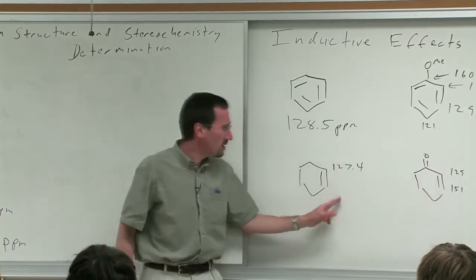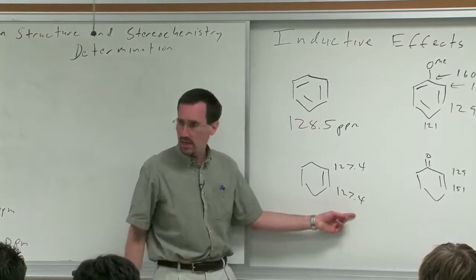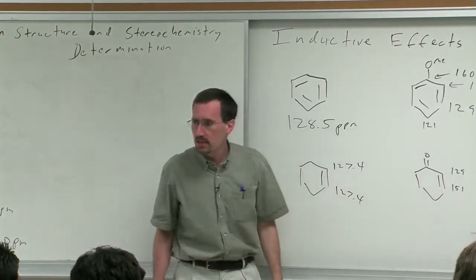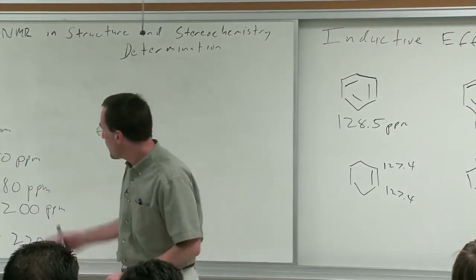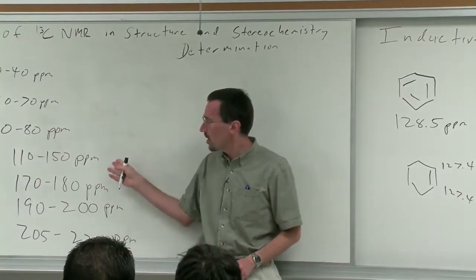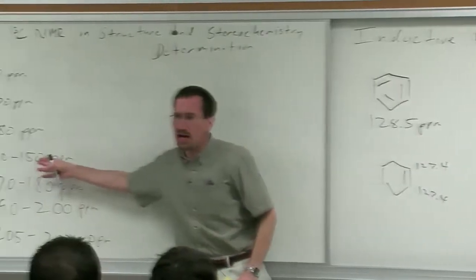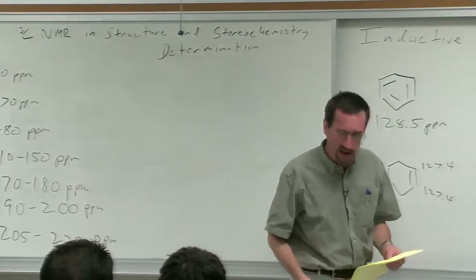And so you see the effect is actually very substantial, right? Both of these carbons are symmetrical. They're at 127. You go more than 20 ppm downfield by decreasing the electron density. These effects can be absolutely humongous. And one of the things that I've tried to emphasize when I've talked about these ranges is that these are general ranges. These are not carved in stone. And so you already see, for example, that this one inductive oxygen here brings us even outside of this very generic range. Let me show you just how huge the effects can be.